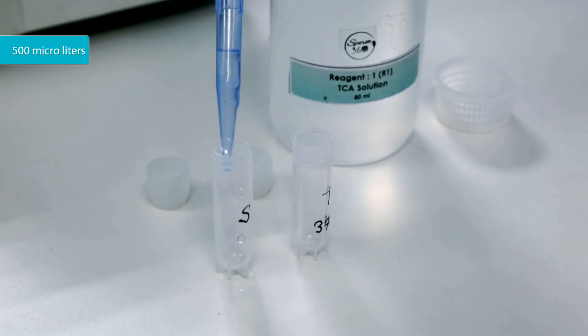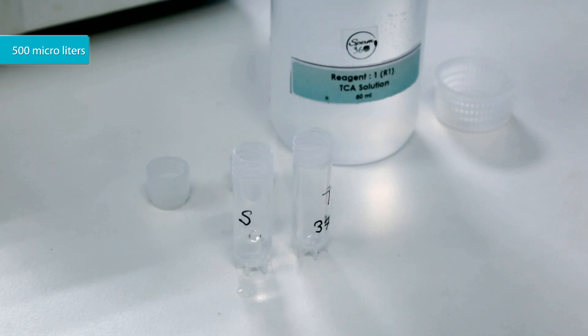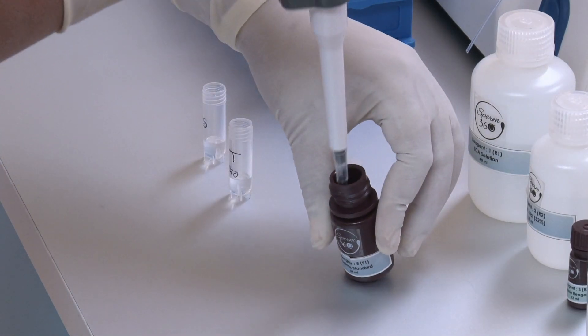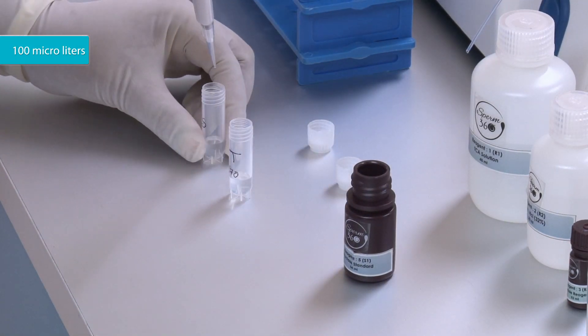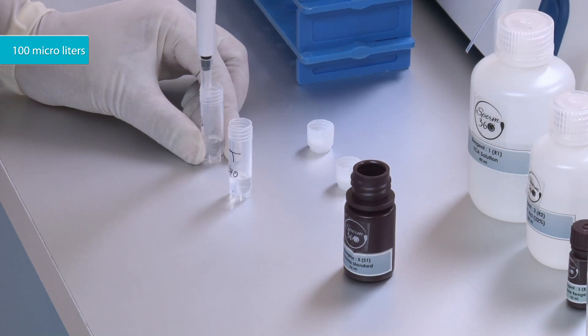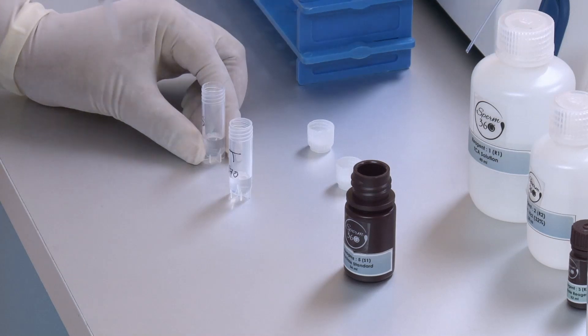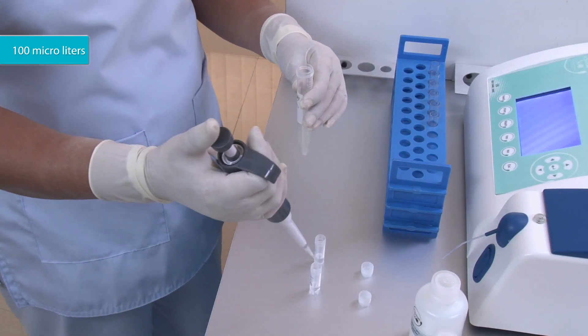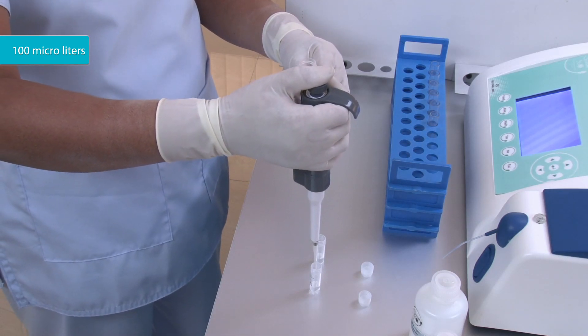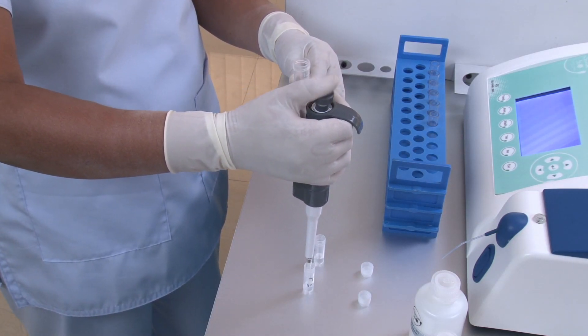Put 500 microliters of Reagent 1 to both tubes. Add 100 microliters of Reagent 5 to the tube labeled Standard. Take 100 microliters of Semen or Seminal Plasma and add it to the tube labeled Test.